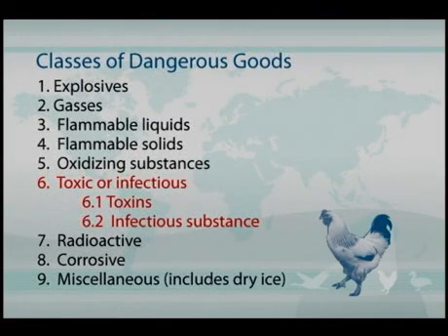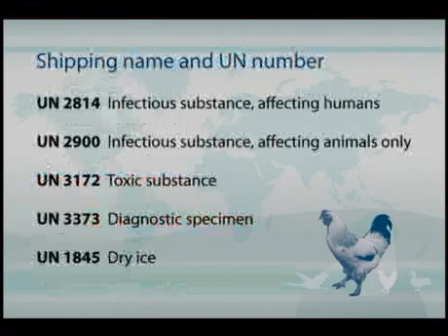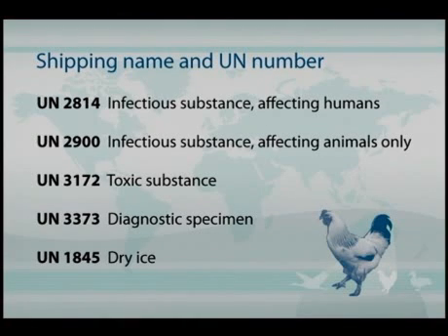Now let's just review the classes as they apply to commonly shipped samples. Toxins are classified as 6.1 agents, and infectious substances are 6.2. And you notice that dry ice is under miscellaneous category 9. Now these dangerous goods are also assigned a proper shipping name, and that is found in IATA 4.2 if you go to their website. The proper shipping names are used basically for consistency and are used in shipping documents and notifications that must be present on each of the packages that are shipped.